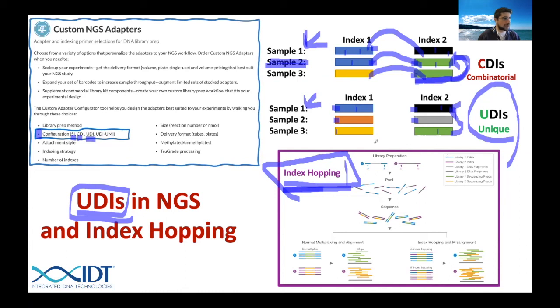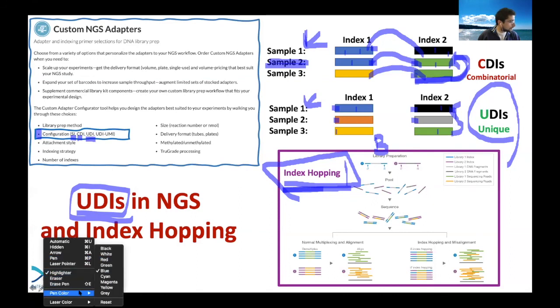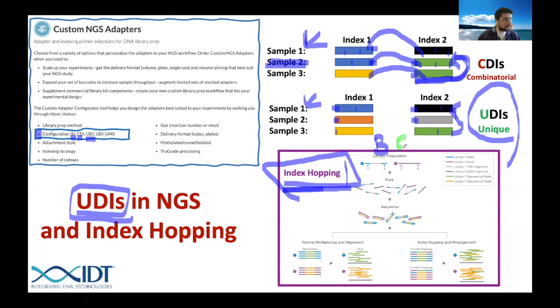So now you don't have black anymore, and I have my sample with blue and green.